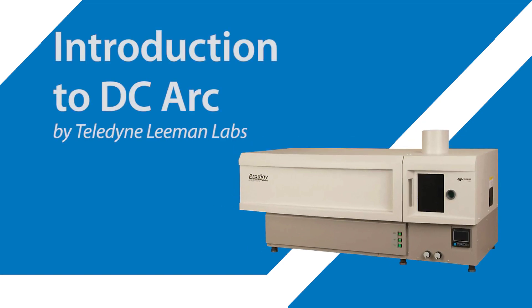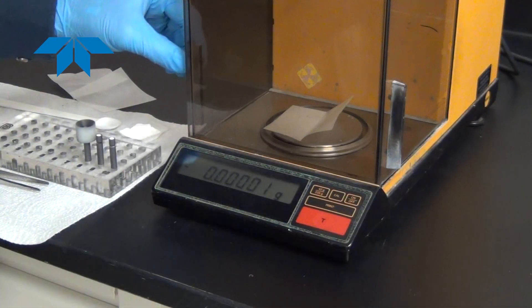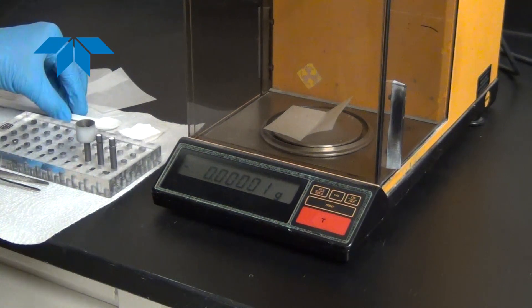This is a brief introduction to the Prodigy DC Arc by Teledyne Leeman Labs. Running samples on the Prodigy DC Arc is straightforward.